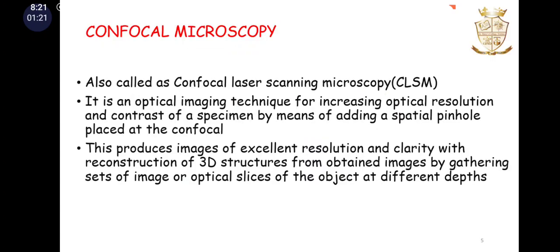Next is confocal microscopy. It is also called confocal laser scanning microscopy, and it is an optical imaging technique for increasing the optical resolution and contrast of a specimen by adding a spatial pinhole placed at the confocal plane.